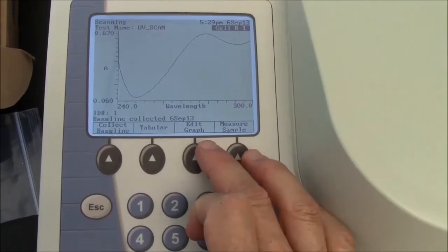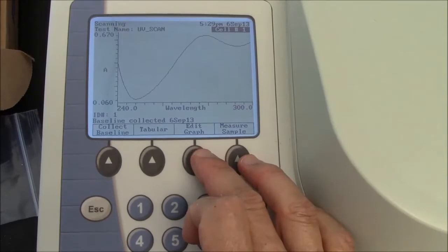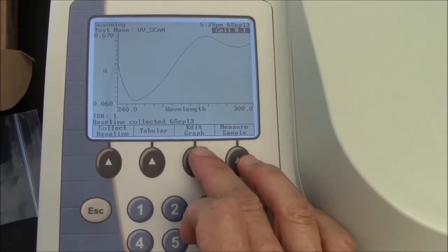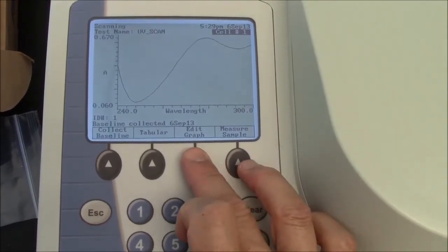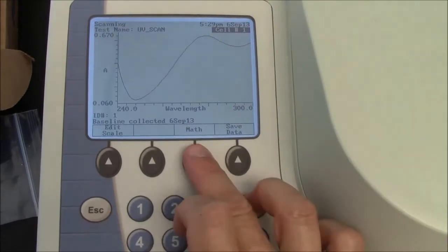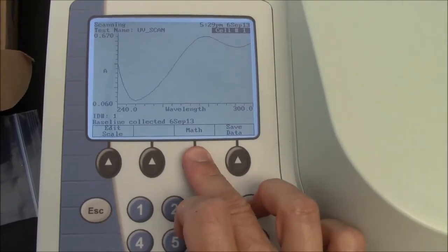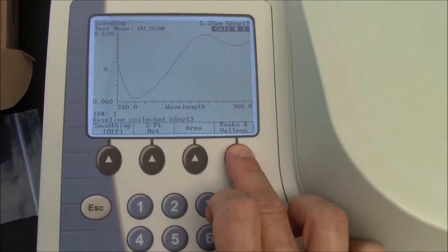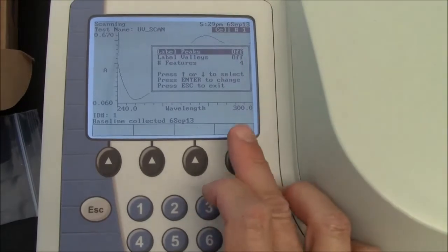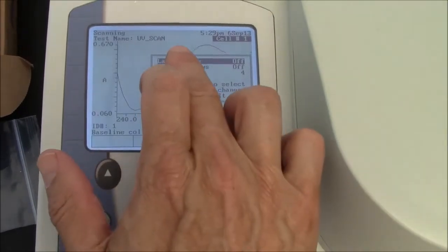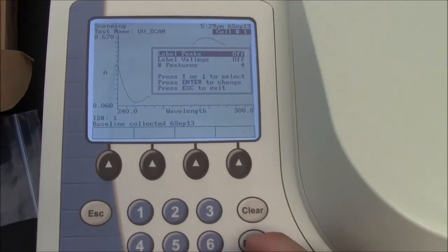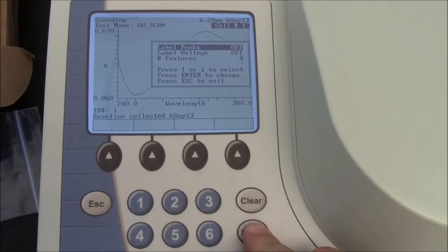I want to put labels on my peaks. In this case I think I'll get only one peak label. I'll go to Edit Graph, then Math, Peaks and Valleys. Right now it says label peaks is off. I'll turn that on by pressing enter.